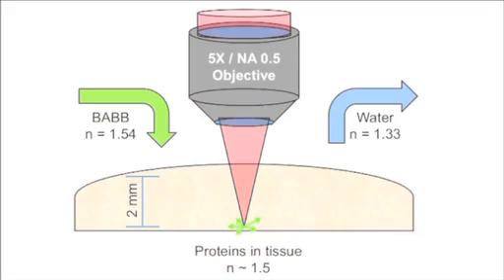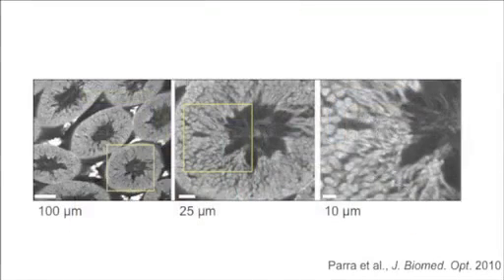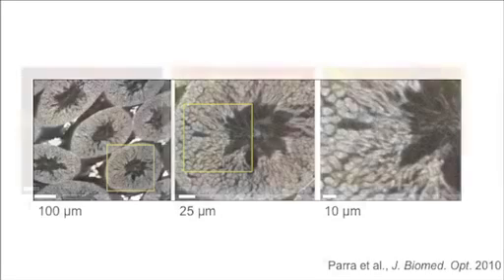Demonstrate how this technique can be applied to view the histology of different mouse organs using intrinsic fluorescence and second harmonic generation. This first image is of the mouse testicle taken 1.4 millimeters beneath the tissue surface. The high-resolution property of multiphoton microscopy allows us to zoom in and get a clear look at the individual sperm cells forming in the seminiferous tubules as seen on the far right.